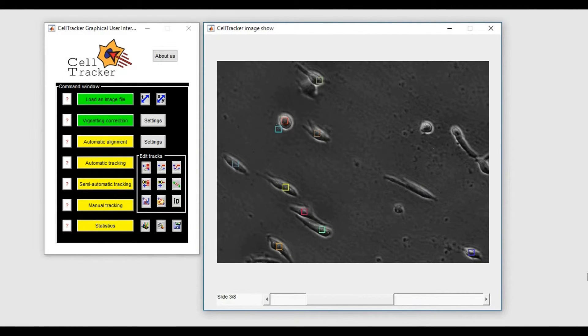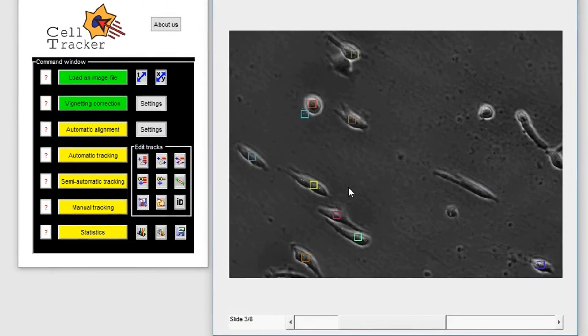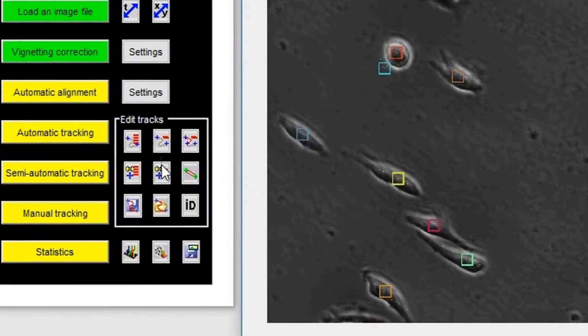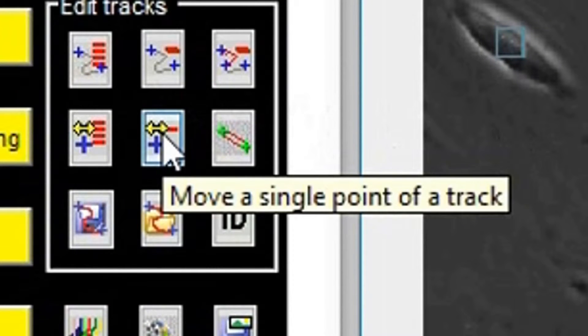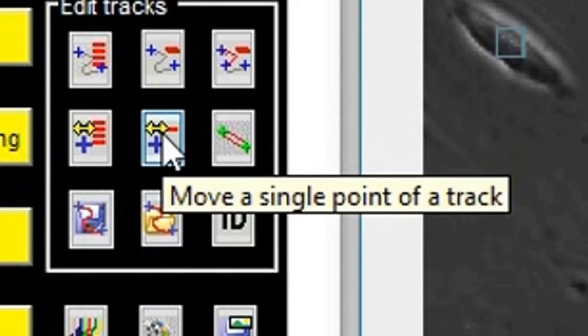We have also implemented this button here to allow the user to move a single point of a track at a single time point.